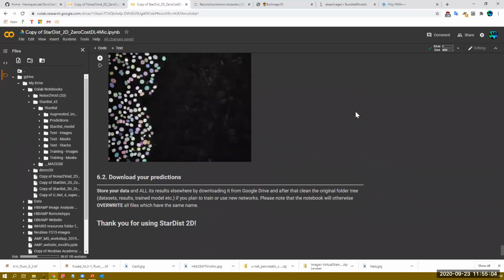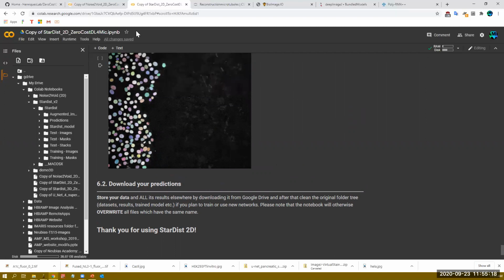And it goes through pretty quickly if you use the example data and just use the default values. But this is a good place for you to kind of see or learn how a deep learning network would work with images.